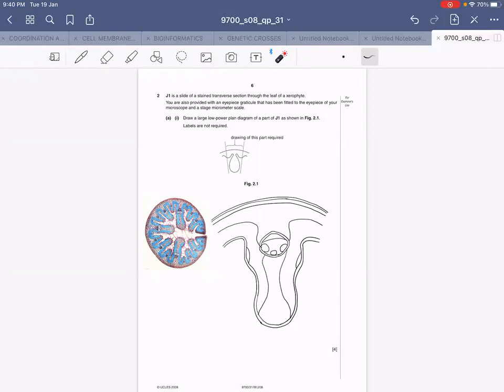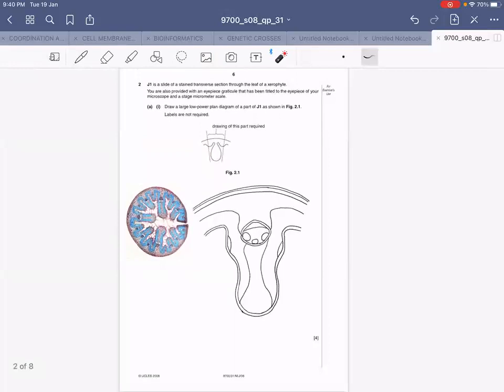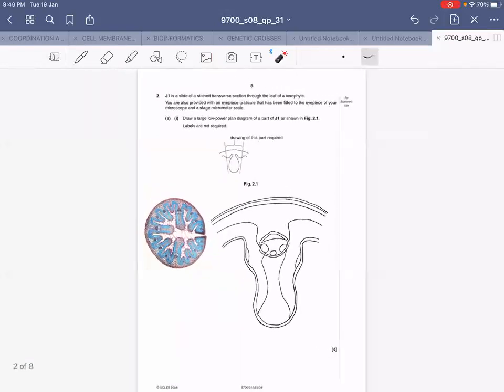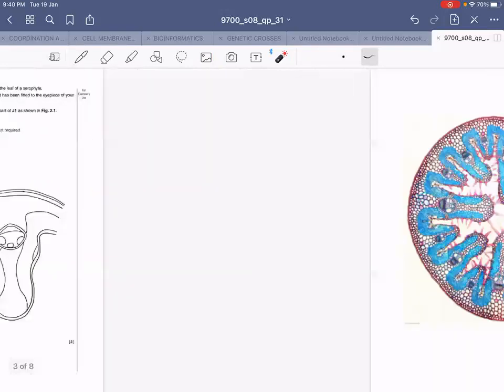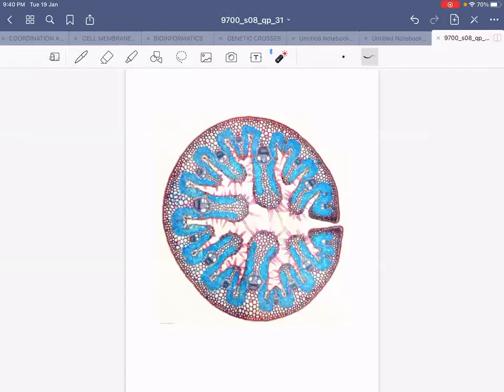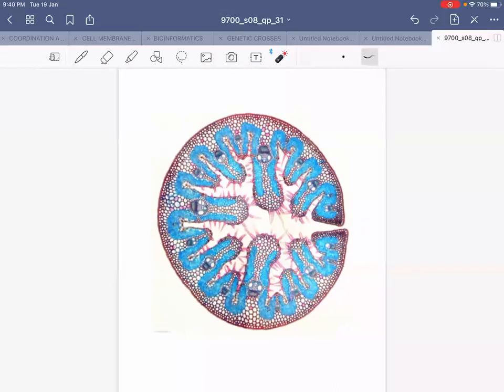When you are done with this portion you will move on to the part which requires you to use the eyepiece graticule and the stage micrometer. This is an enlarged view of the same slide which you have been given today — the slide of a xerophyte, a plant that grows in a desert.